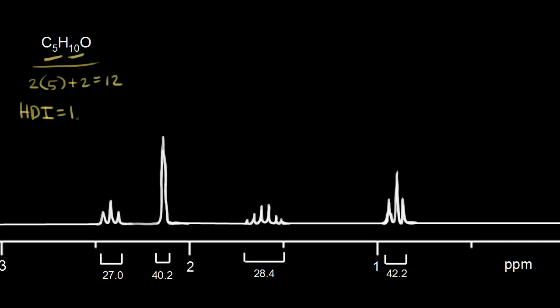Immediately that makes me think about a double bond or one ring. Let's look at the integration values. This signal has an integration value of 27, this signal is 40.2, this one is 28.4, and this one is 42.2.